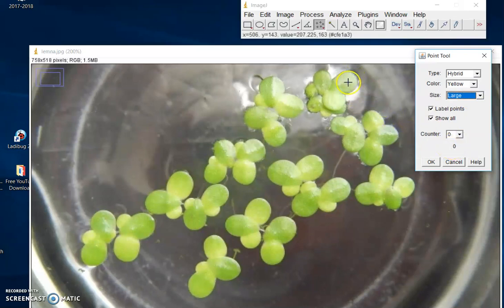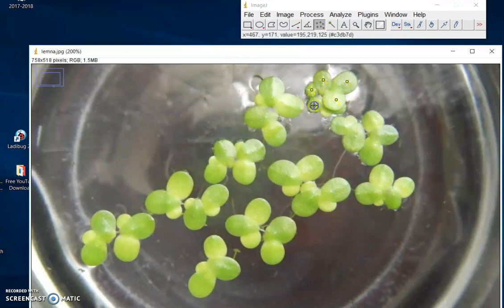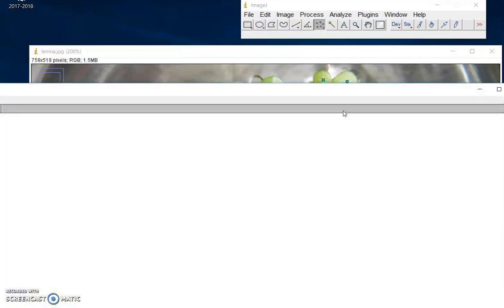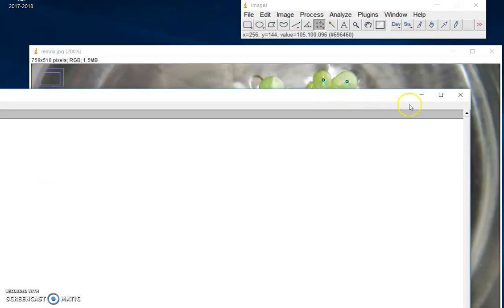I'm going to go over and scroll over this frog and click, and click each of the structures that I'm going to count, even this one, as a frog. If I hit Control+M, there's my count — I have seven so far. That's one way to find out how many I have.